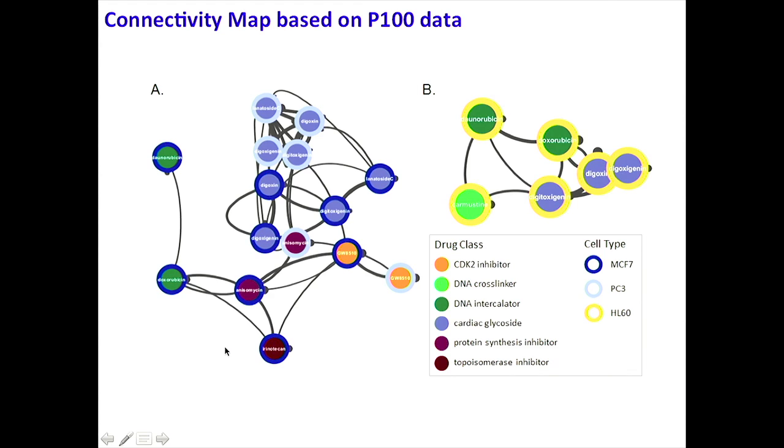Okay. Now, we can also take these phosphoproteomic panel data and arrange them into connectivity maps. And so now what I'm showing you is an arrangement of all of our initial experiments. Again, just using correlation coefficients to weight edges between these nodes, the way that the nodes are encoded. The center color is the class of drug that is being treated onto the cells here. The outer circle is the type of cell that we have treated with these drugs, and then we just let everything organize.